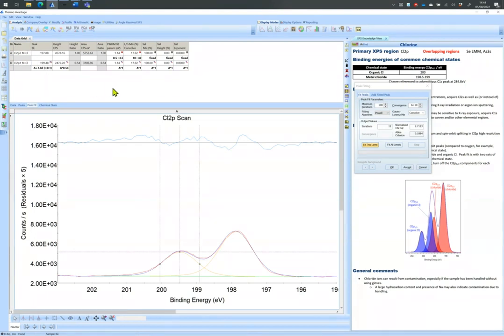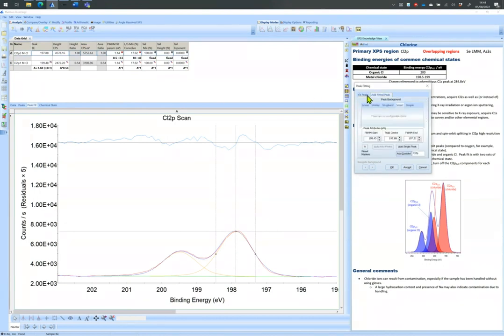If you are interested in fitting properly this core level, then you should look more attentively at the fitted data. The first thing you should notice is that the fitting model is not fitting well around 200.5 eV and 197.5 eV. The second thing you should notice is that the Cl2p1 component is constrained to the 2p3 component using a factor of 0.54 instead of 0.5. Change this value to 0.5. Re-click on Fit this level.